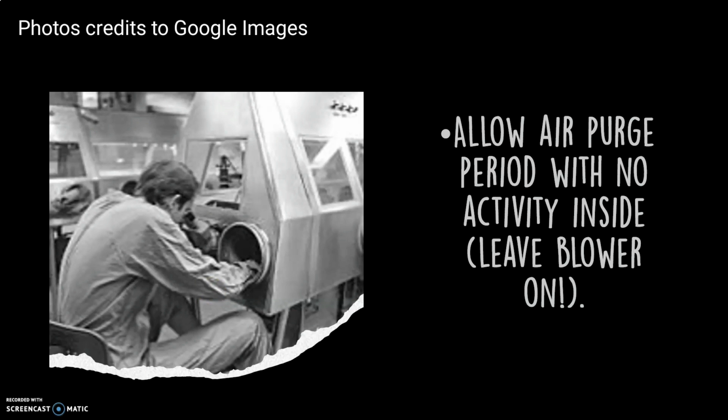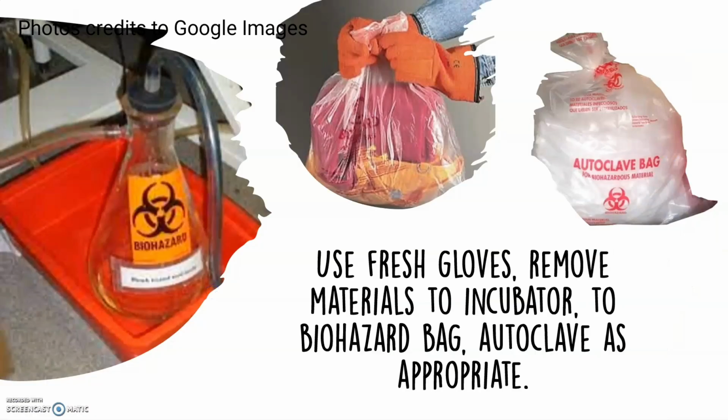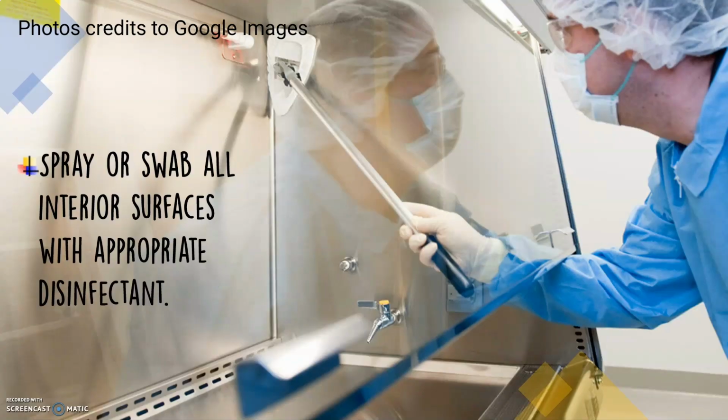Yun talaga, mga nagtatrabaho na sa mga laboratory institutions. For the terminal disinfection, use fresh gloves, remove materials to the incubator or biohazard bag, autoclave as appropriate. Spray or swab all interior surfaces with appropriate disinfectant.